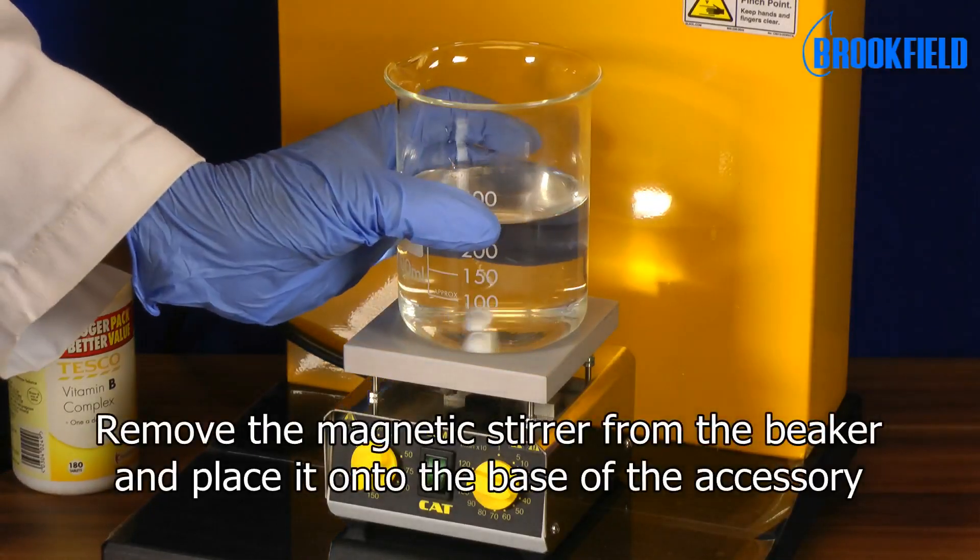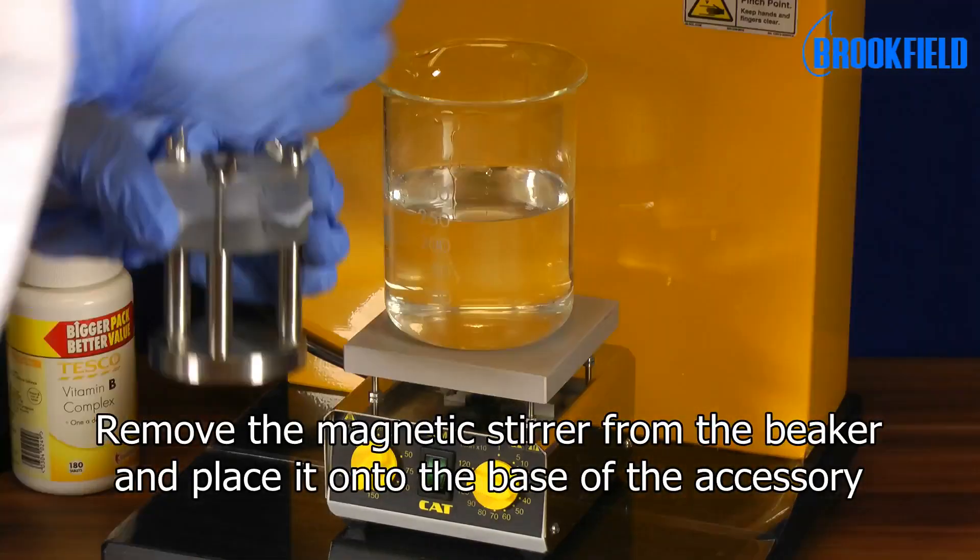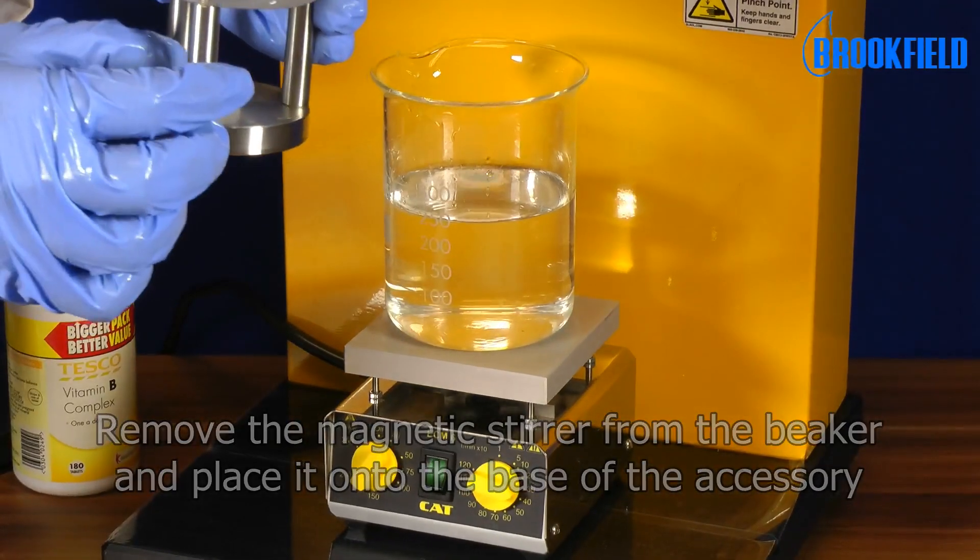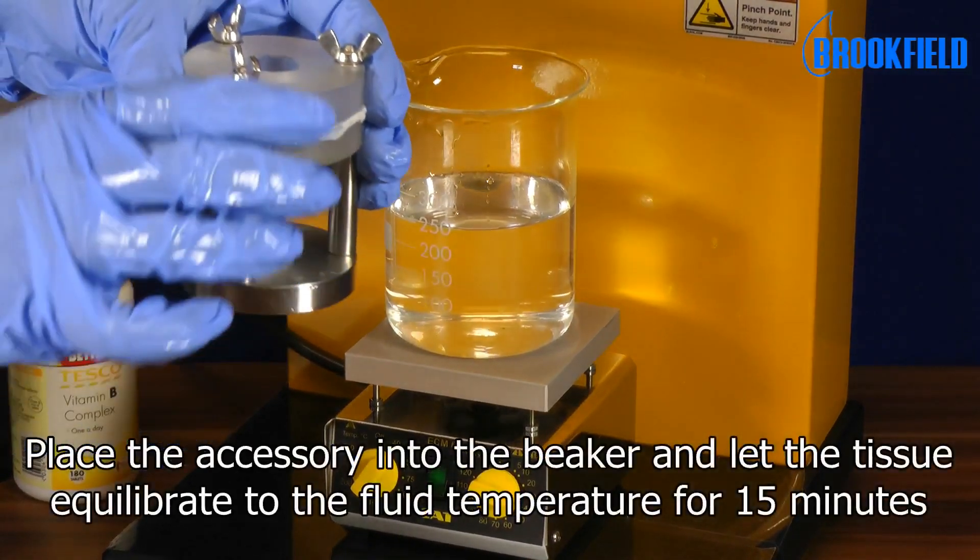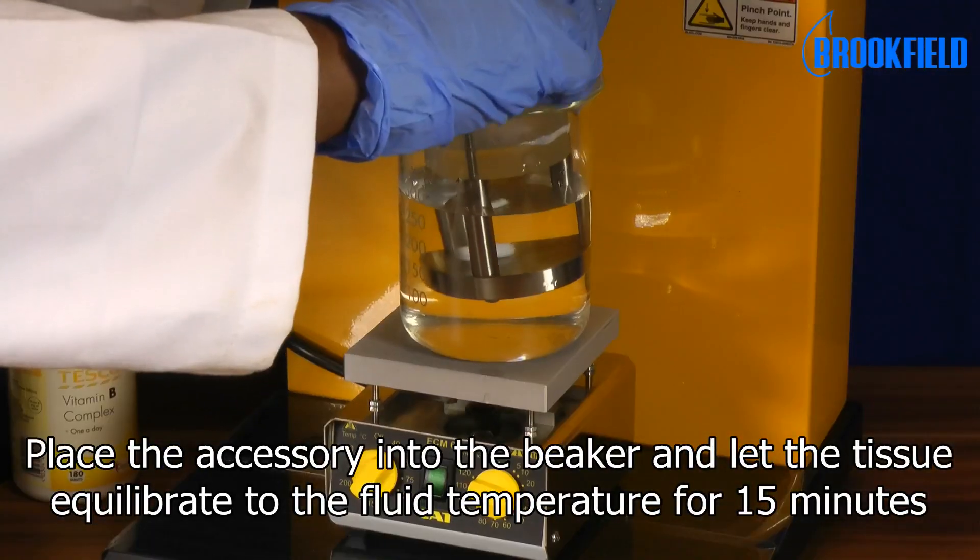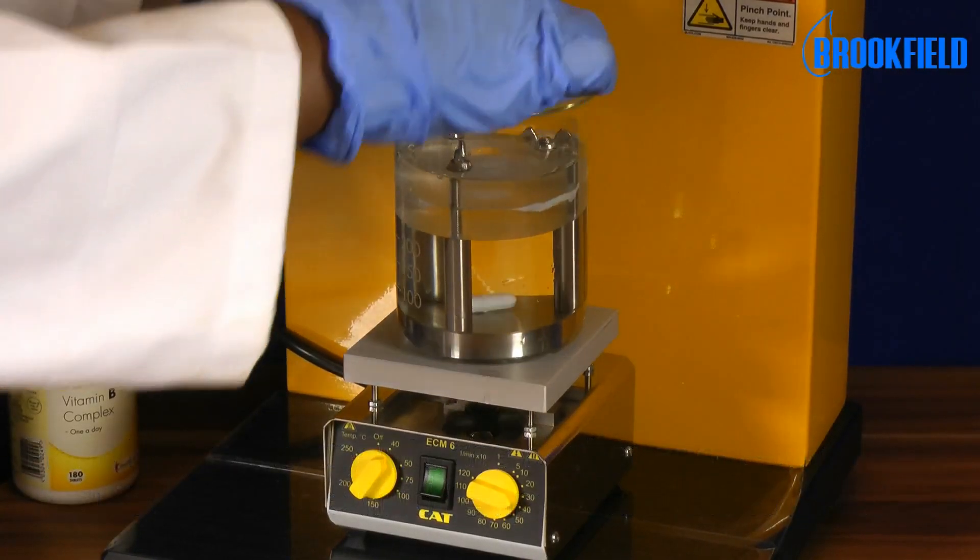Remove the magnetic stirrer from the beaker and place it onto the base of the accessory. Place the accessory into the beaker and let the tissue equilibrate to the fluid temperature for 15 minutes.